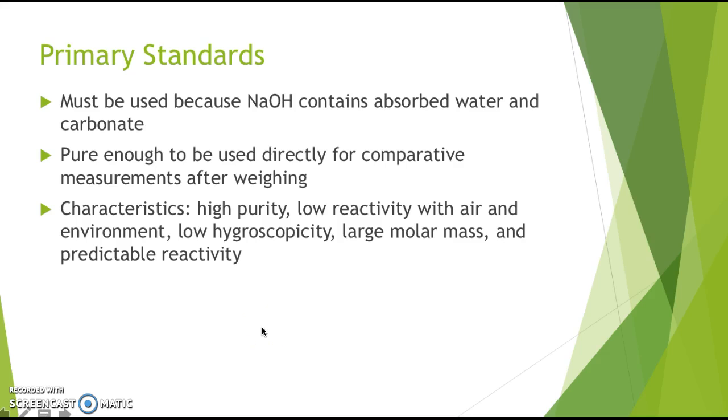Reagent-grade sodium hydroxide must be standardized using a primary standard because it contains absorbed water and carbonate from its surroundings. A primary standard is a reagent that is pure enough to be used directly for comparative measurements after weighing. Primary standards display unique characteristics that make them ideal for making accurate and dependable assessments of concentration without the need for specialized equipment. These characteristics include high purity, low reactivity with the air or surrounding environment, low hygroscopicity or ability to absorb or release water, large molar mass, and a predictable reactivity.